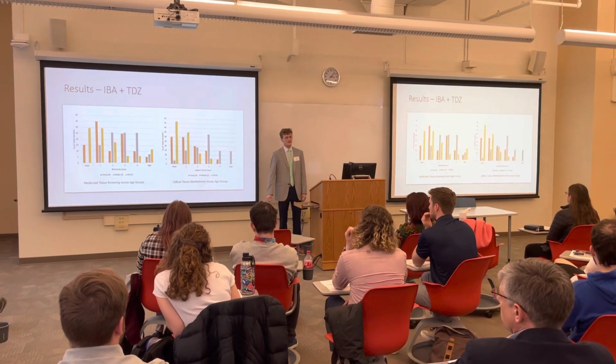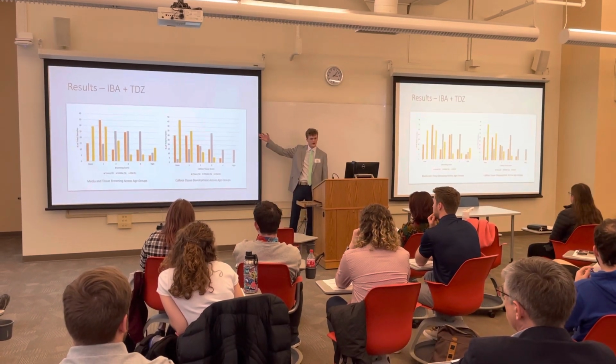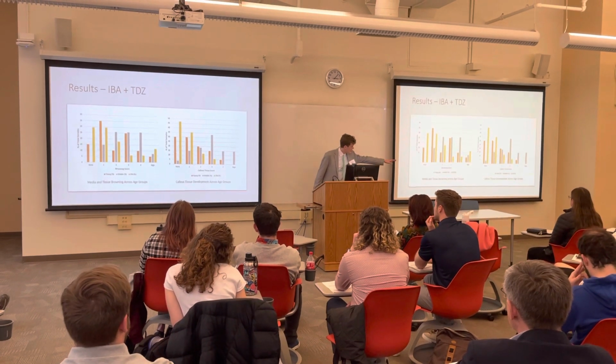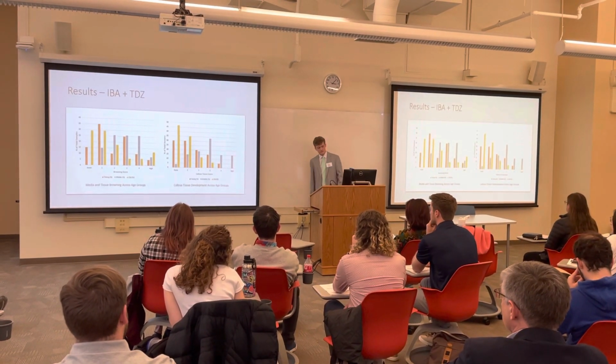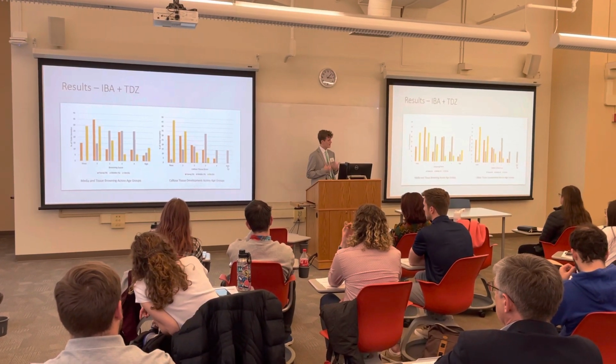But when it comes to callus tissue, what do you see? Does everyone see that gray bar in the higher categories here? That's important. We're getting the higher callus tissue formations in those middle plants, thus at least giving credence to our hypothesis, right? Really good.